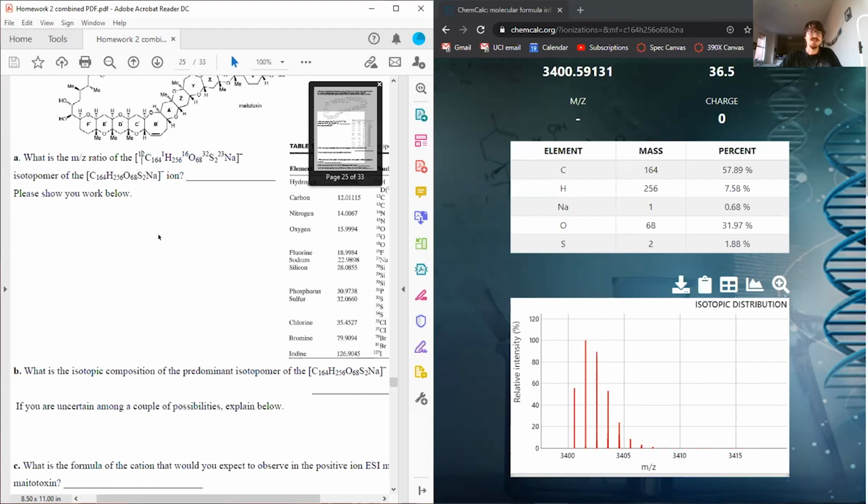James, would you like to comment at all on the actual statistics of doing this math? So I guess what I'd say is I'm looking for sort of calibrated intuition rather than doing the statistics. And I remember back from a long time ago in doing statistics, certainly one way of doing it is, okay, what's the likelihood that one carbon is C13, or to put it another way, that they're all but one is C12.